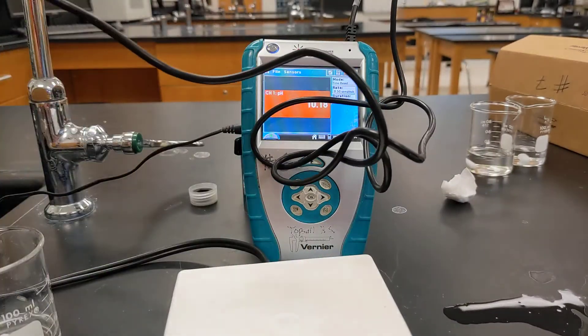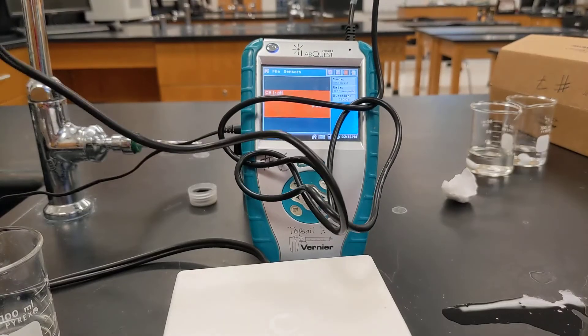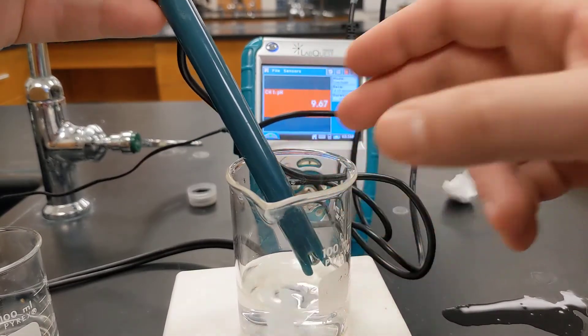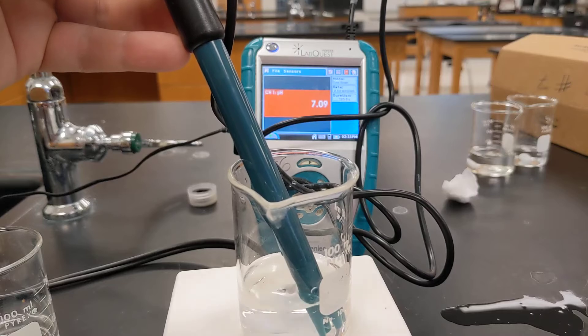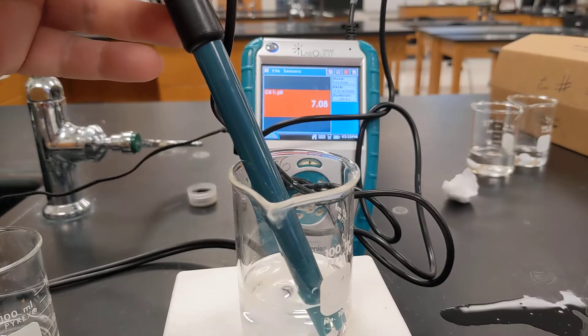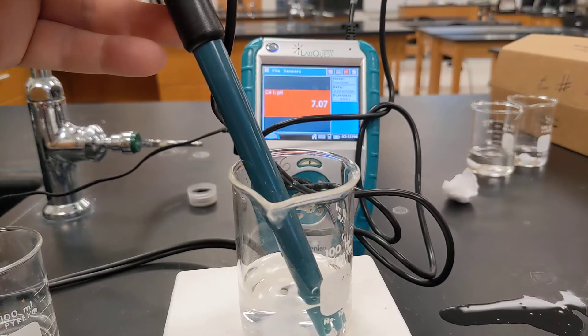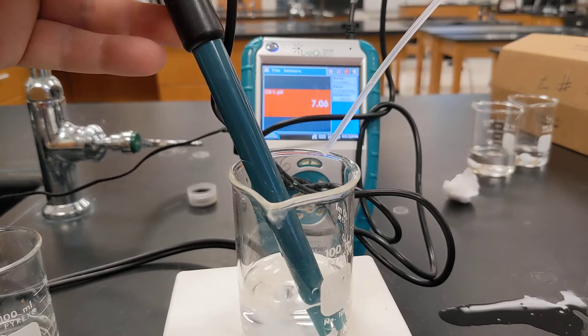Now, what if instead we use a buffer solution? So I have right now a buffer solution here. This consists of sodium hydrogen phosphate and sodium dihydrogen phosphate, which makes a nice buffer solution with a pH of seven. So if I add some hydrochloric acid, let's see what happens. I add a drop.